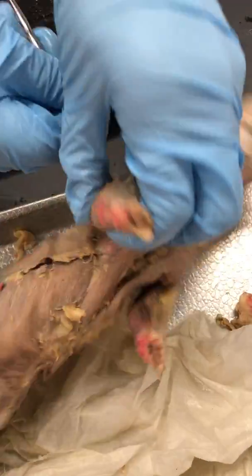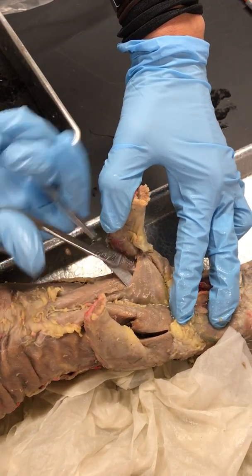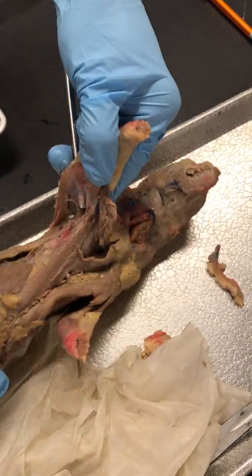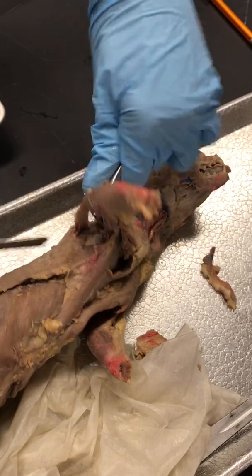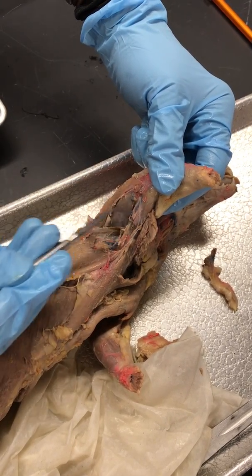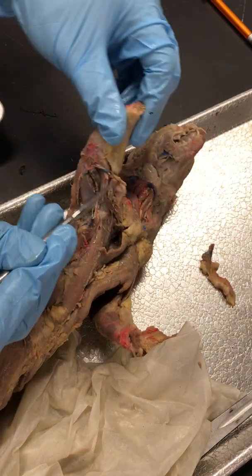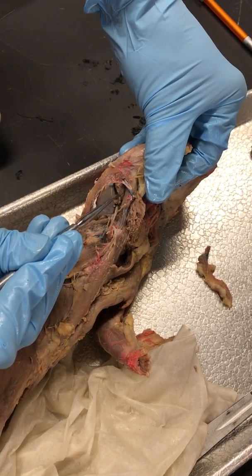Let's try it from the other side. This is Pectoralis Superficialis here — it's kind of blocking our view. So if I cut Pectoralis Superficialis, I can see Pectoralis Profundus underneath. If I look up under his arm and cut away some of those nerves, I can usually find the medial head a little bit easier. So that's the long head, and then that smaller one is the medial head — it's right next to the big one, kind of triangle shaped.